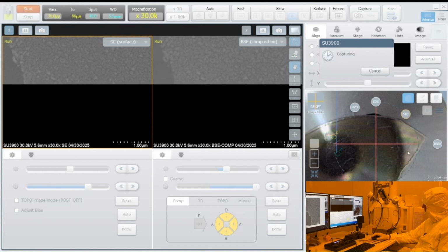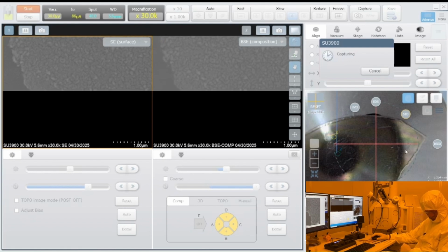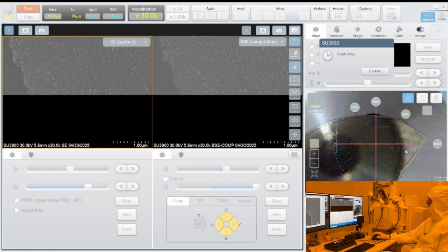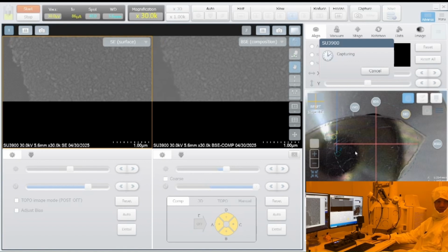So the gratings are not too small though. Cross-sectionally, these are about 20 nanometers high and 200 nanometers wide. So how is this film put down? We use an E-beam thermal evaporator. Okay.